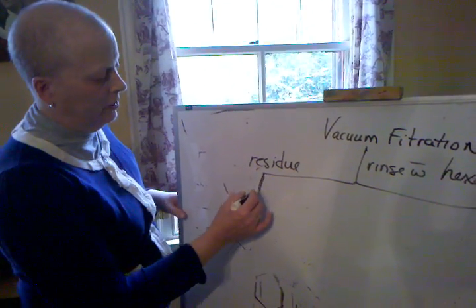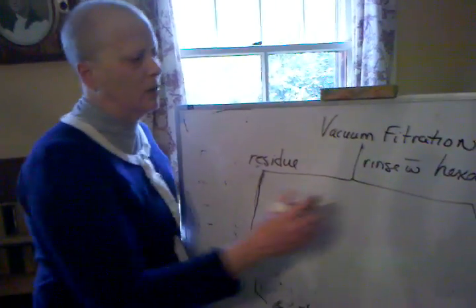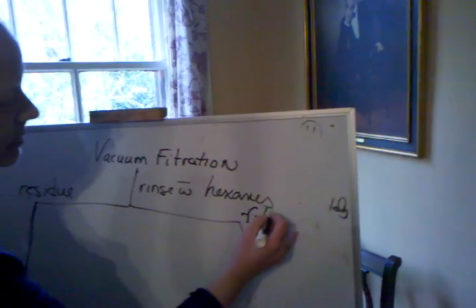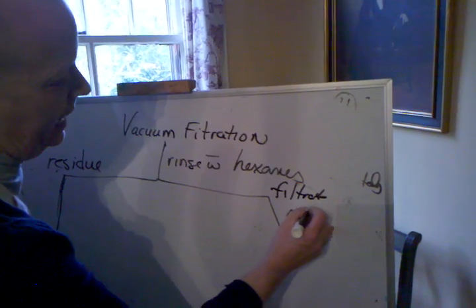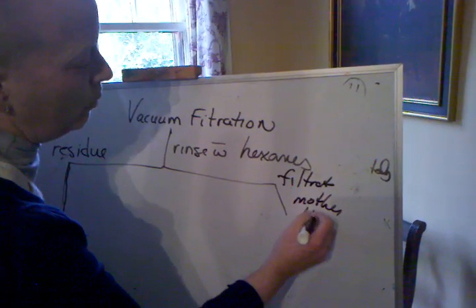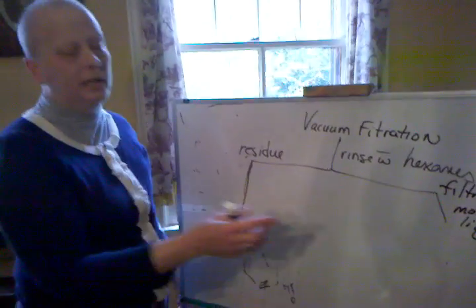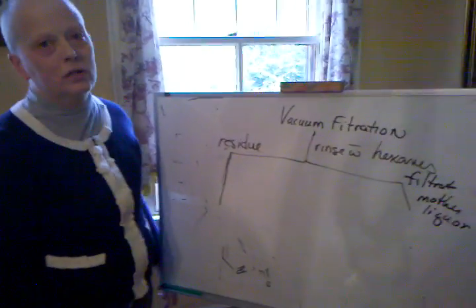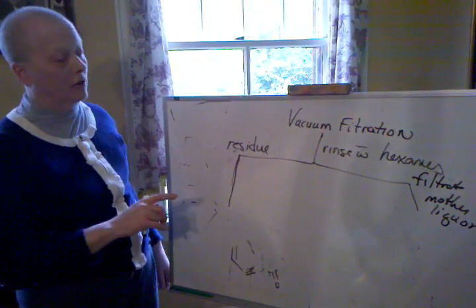Okay, so what do you have to do? Oh, and the filtrate here, the filtrate is just sort of like the mother liquor of the reaction. And we might want that. Don't throw that out. Hold on to that, because if for some reason you have a terrible yield, we might have to fish some crystals out of that mother liquor, so don't throw that away. And don't start vacuum filtering until you've checked in with us.